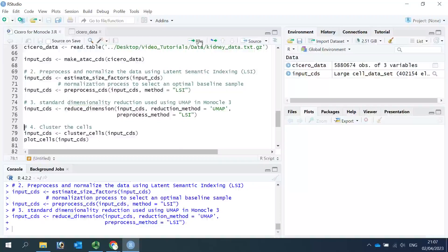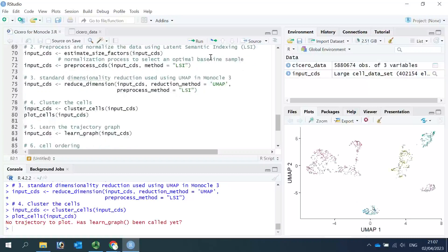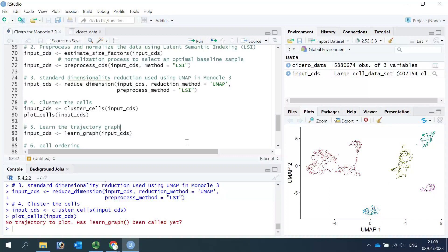After data normalization, we go to the third step — run UMAP to reduce the dimensionality. The reduction method is UMAP and the preprocessing method is LSI. After UMAP, we can cluster the cells. Now we are ready to see the cell clusters using the plot_cells function from Monocle3. You can see we got five cell clusters in this kidney dataset.